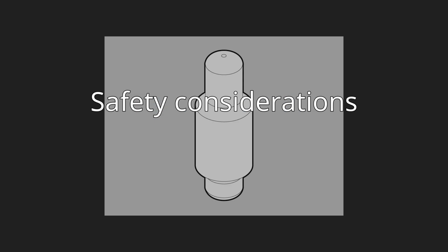Safety considerations. Safety is an important consideration when glassware is under vacuum pressure. Scratches and cracks can result in implosions when the vacuum is applied. Wrapping as much of the glassware with tape as is practical helps to prevent dangerous scattering of glass shards in the event of an implosion.